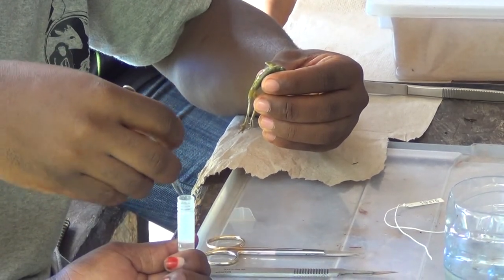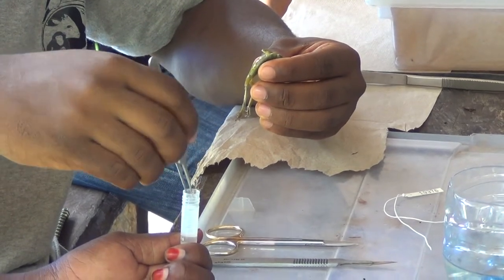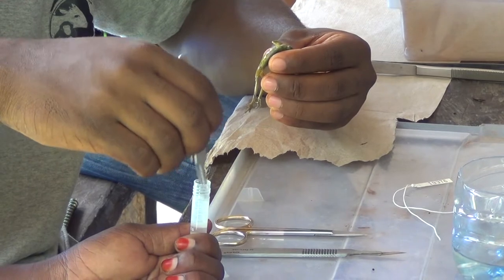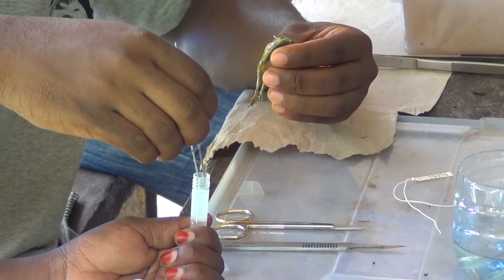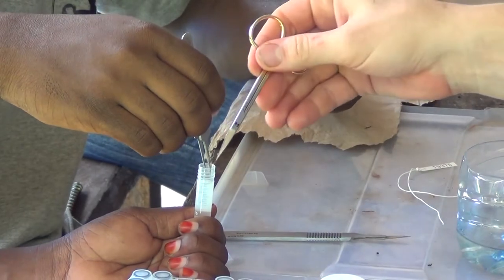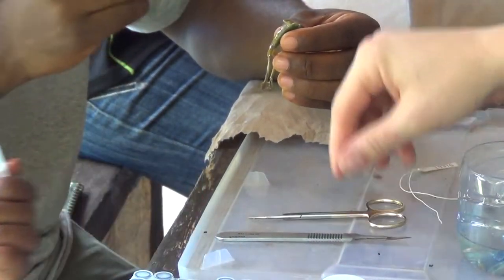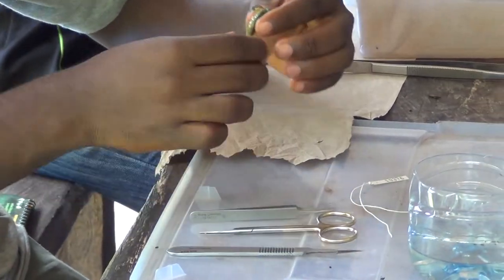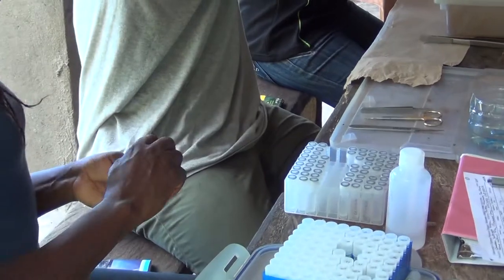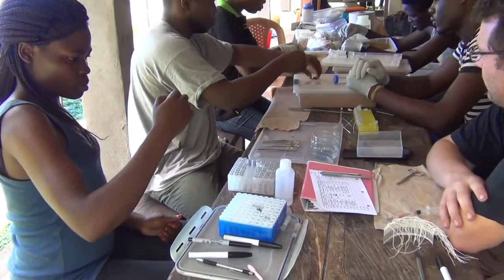We have dedicated pieces of dissection equipment — scissors and forceps — and then another set that is for preservation.